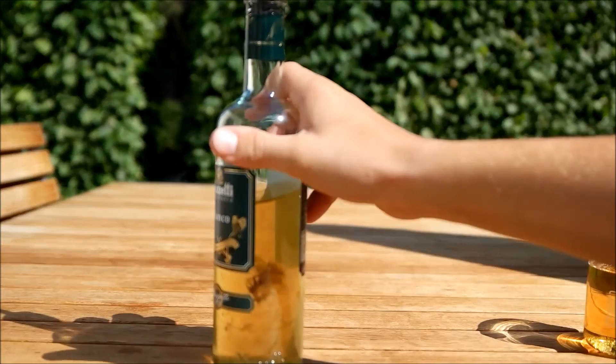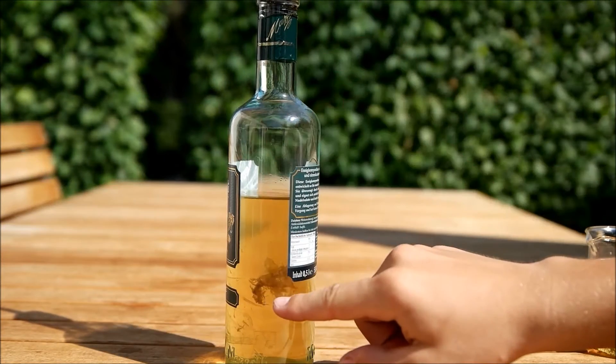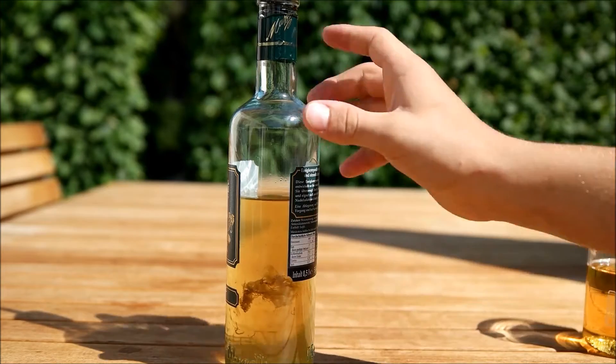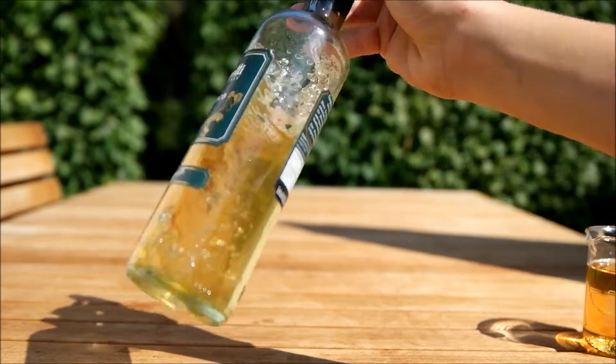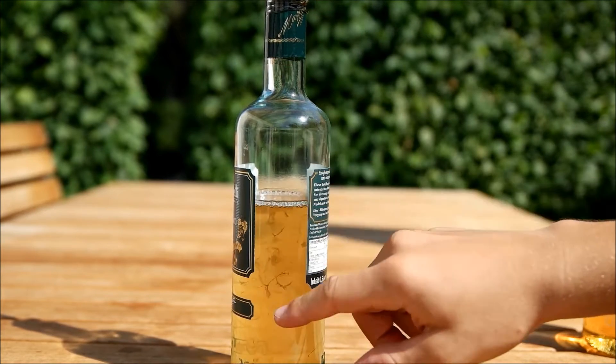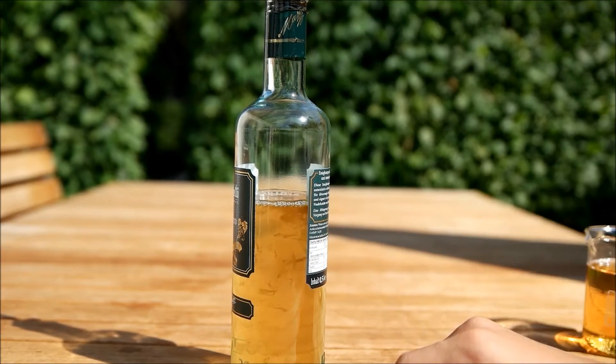The other method is to take an old bottle of vinegar. If you're lucky, after a few months there should be these things swimming around — it's the so-called mother of vinegar. And it's actually pure Acetobacter.